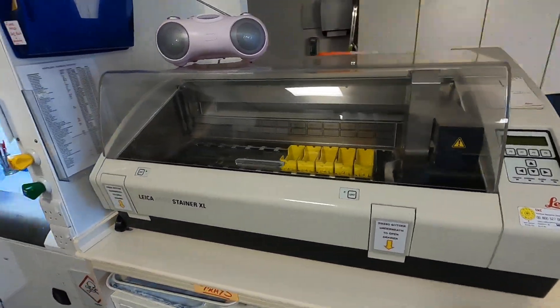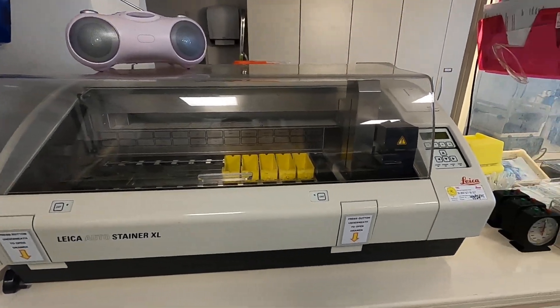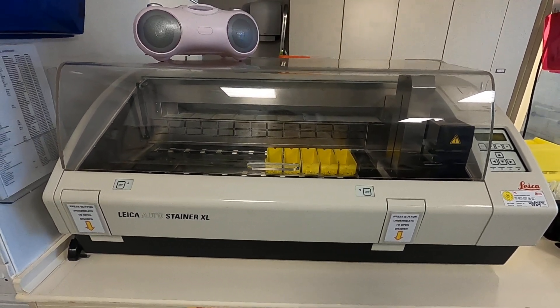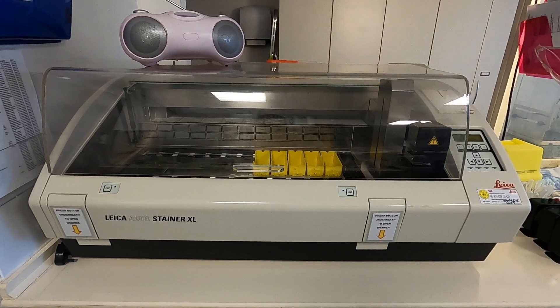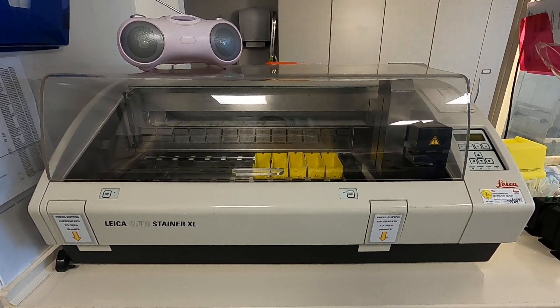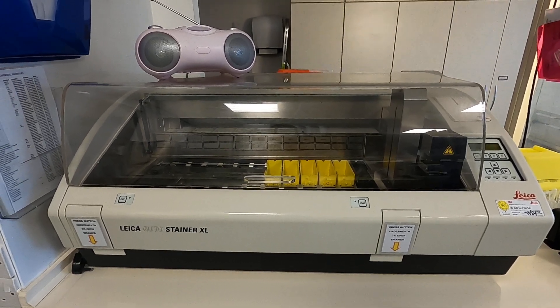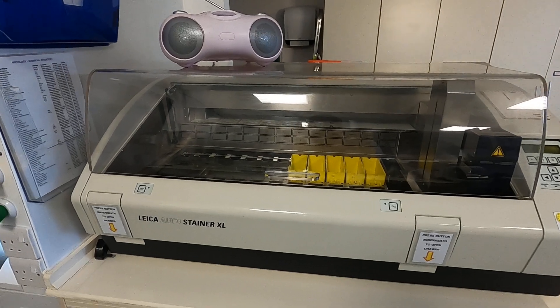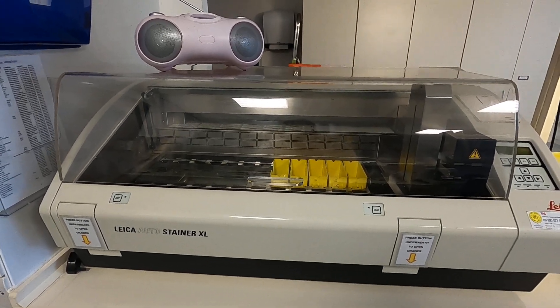You can of course cheat, because you know it wouldn't be science if you can't cheat. This is an auto-stainer, and an auto-stainer does what it says on the tin. You place your slides in a drawer on the right-hand side, push go, and it does all the staining for you over a period of about 20 minutes, and then you can take them up and simply cover slip. So without further ado, let's get on with it and show you what happens when you do microtomy.